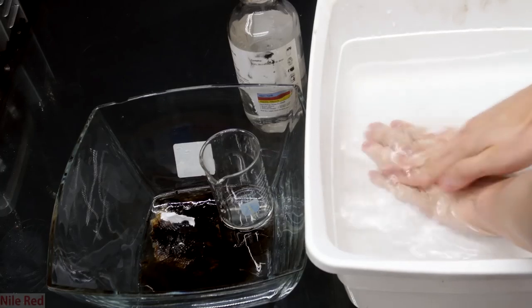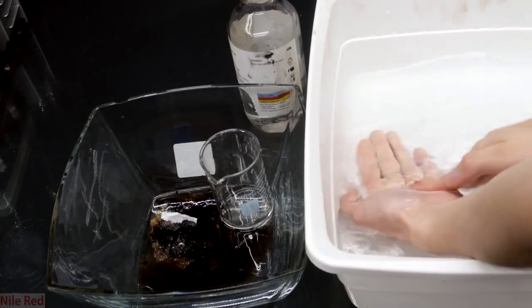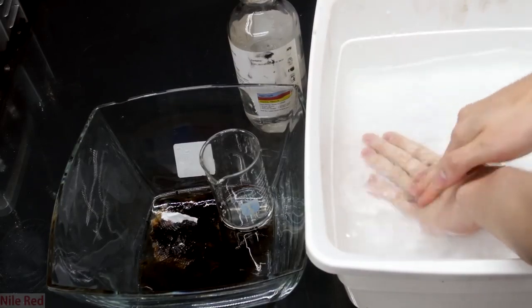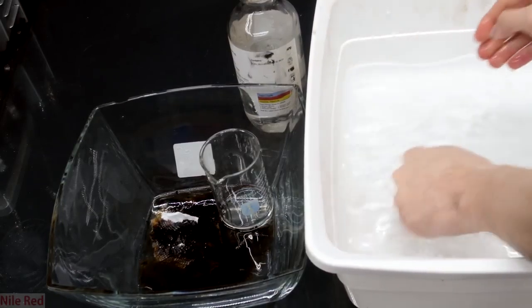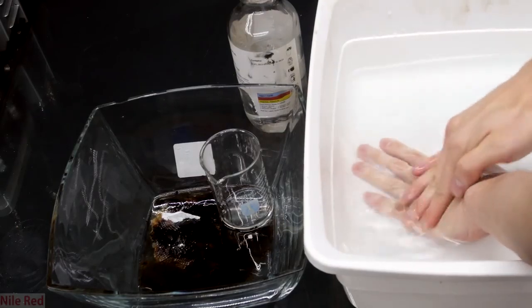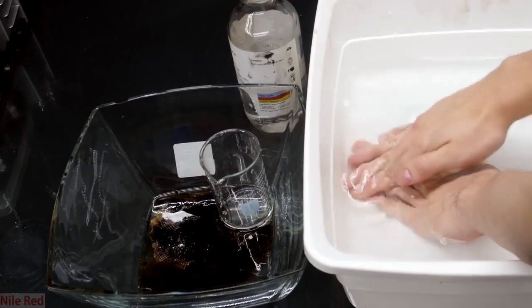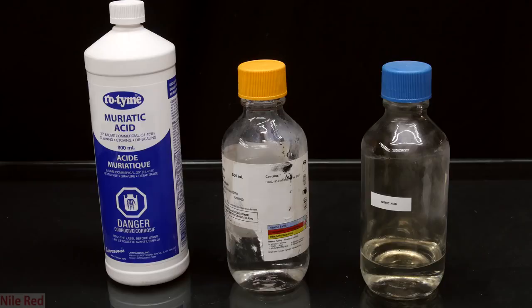Although accidents do happen and you will probably end up with a little bit of acid on your skin, I hope this video showed you that you really don't need to freak out and you just need to wash it off as soon as possible. I would imagine that the average response time is several seconds and not 20 or 50 like I had here. Anyway, that's it for now.